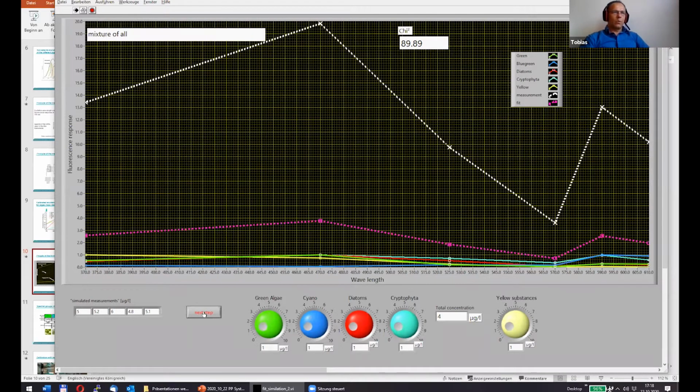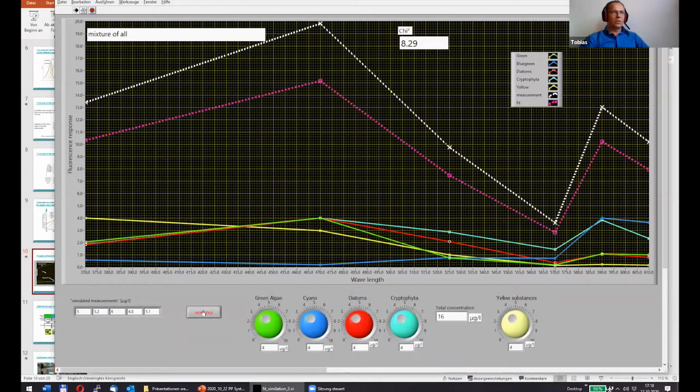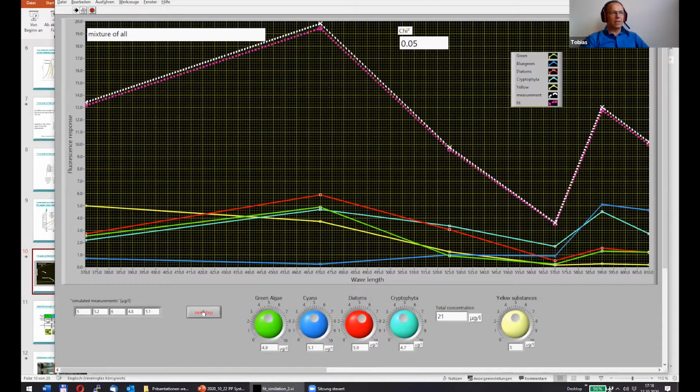Now what we have in nature is the last picture of that. We have a mixture of algae, and if you have a different concentration, you have to multiply a product of the calibrated situation with this content, and you get a better and better chi-square, and you have different groups of algae.